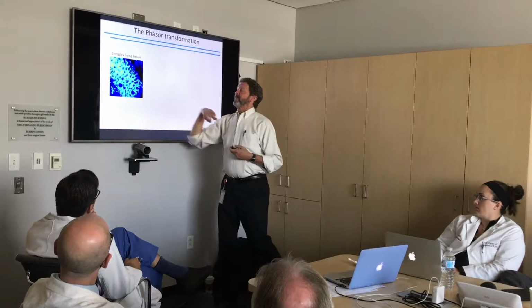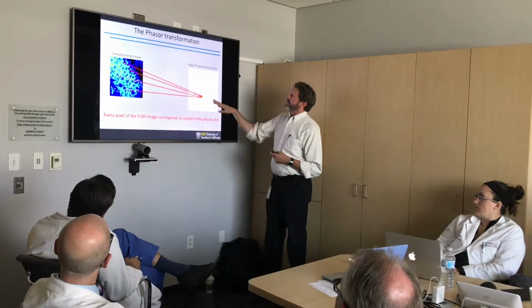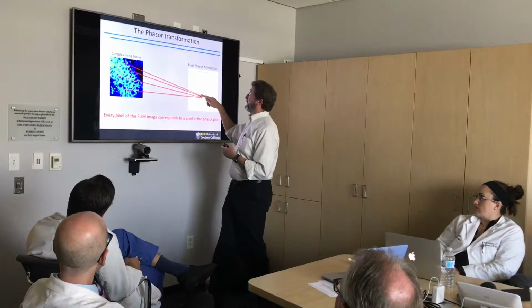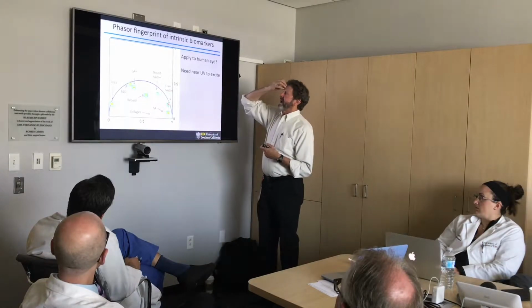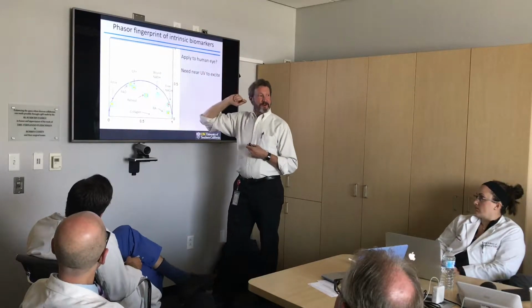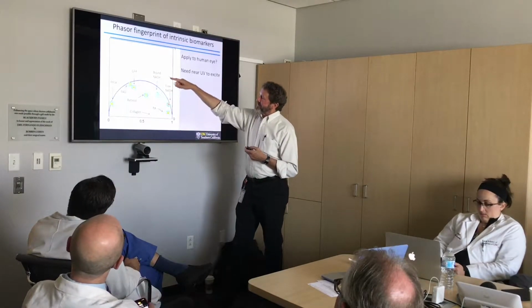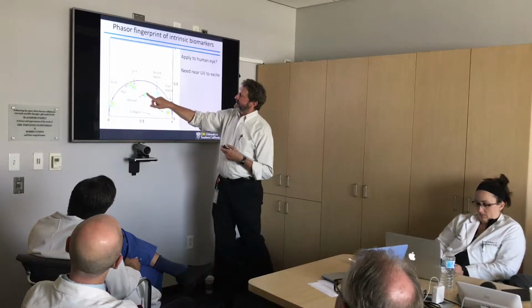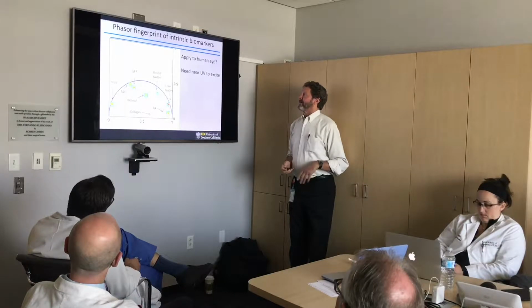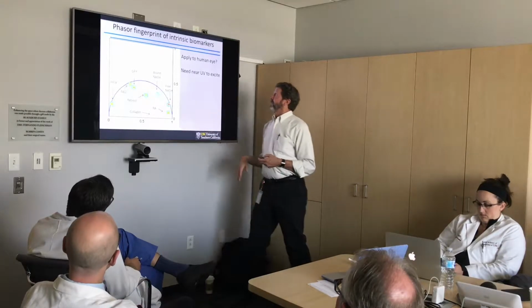If instead we go into a piece of retina, then what you've got is something that's spread out in different regions. You can see that we could move around on this plot and see what's there. And well, I guess very few patients have GFP, although with lab workers, maybe that's no longer true. But you can see things like NADH bound and free, retinoic acid, collagen, retinol, so things that the ophthalmology department cares about. These are in response to an ultraviolet excitation.